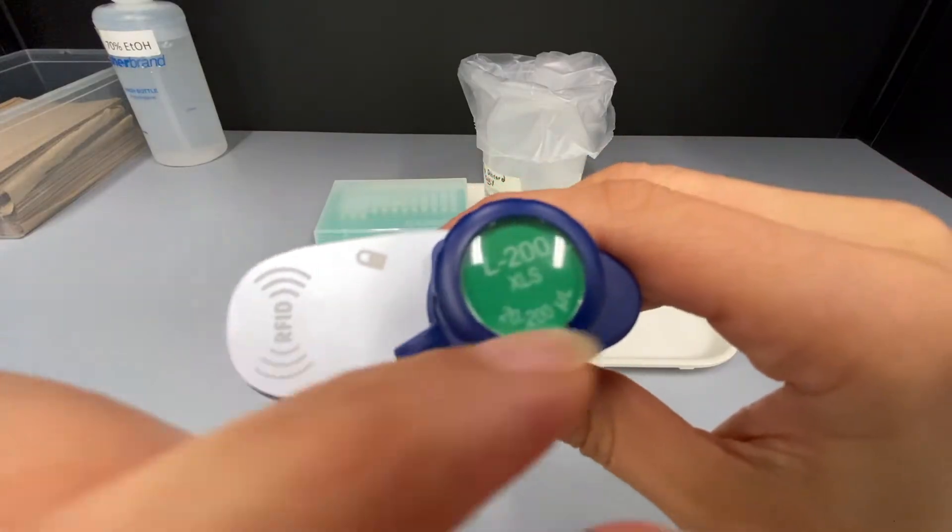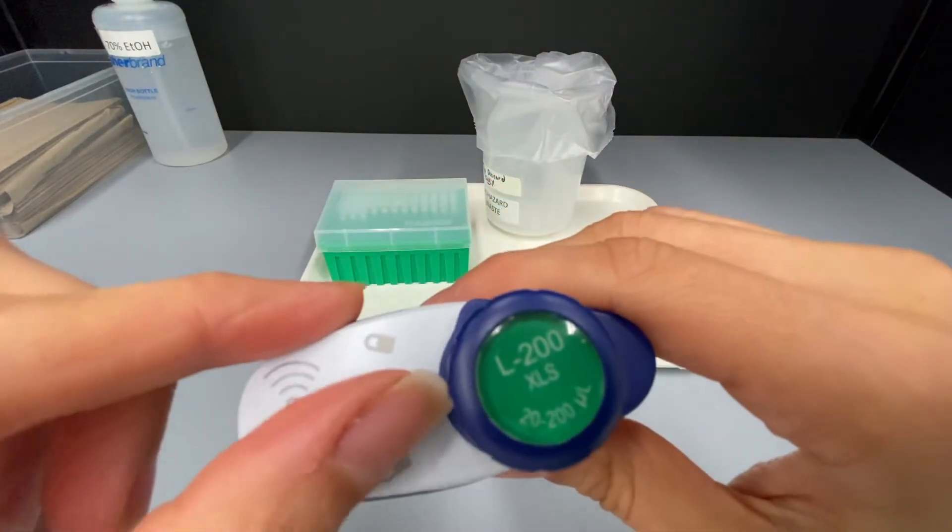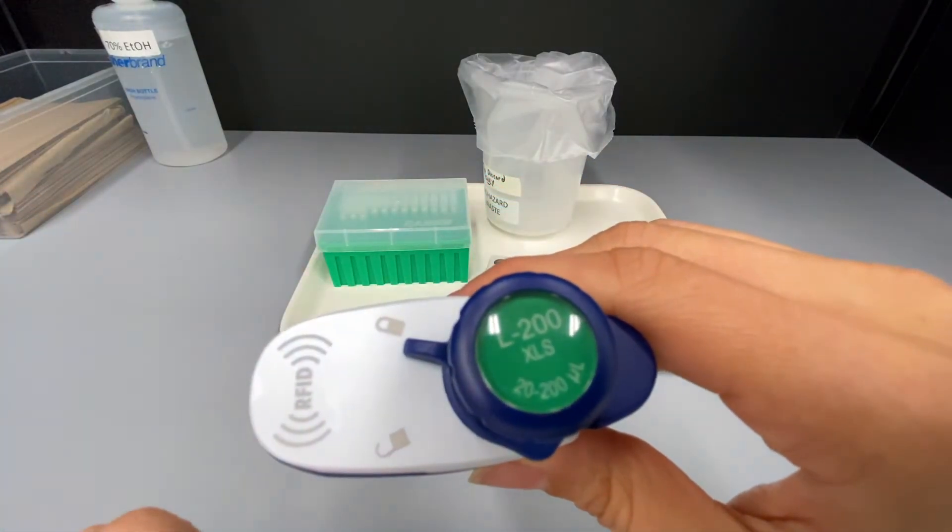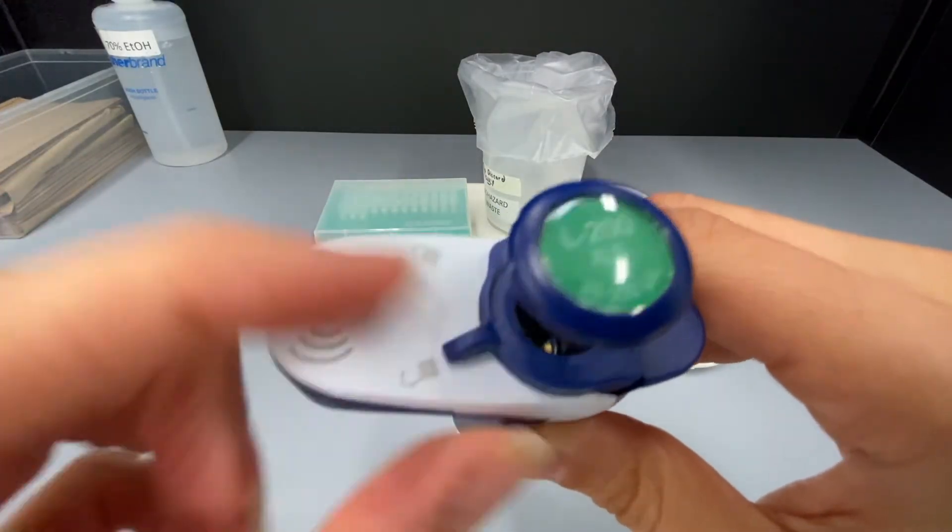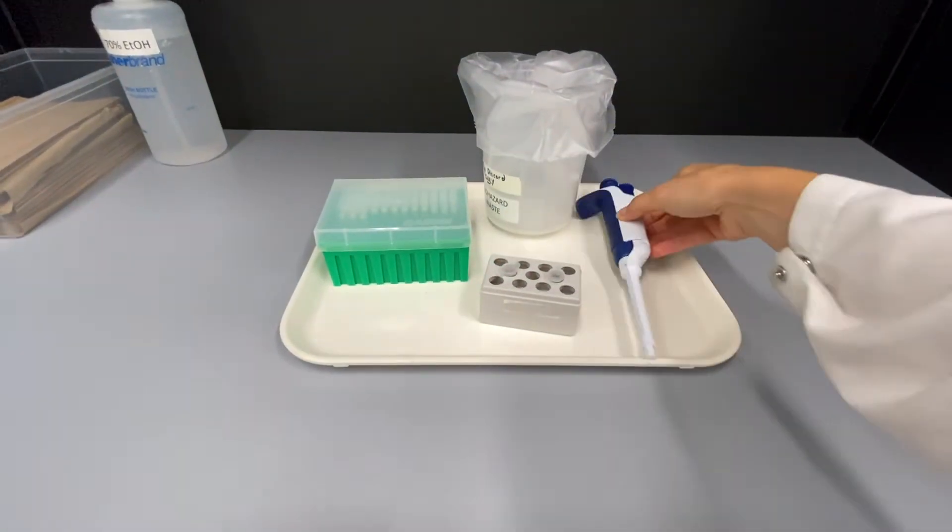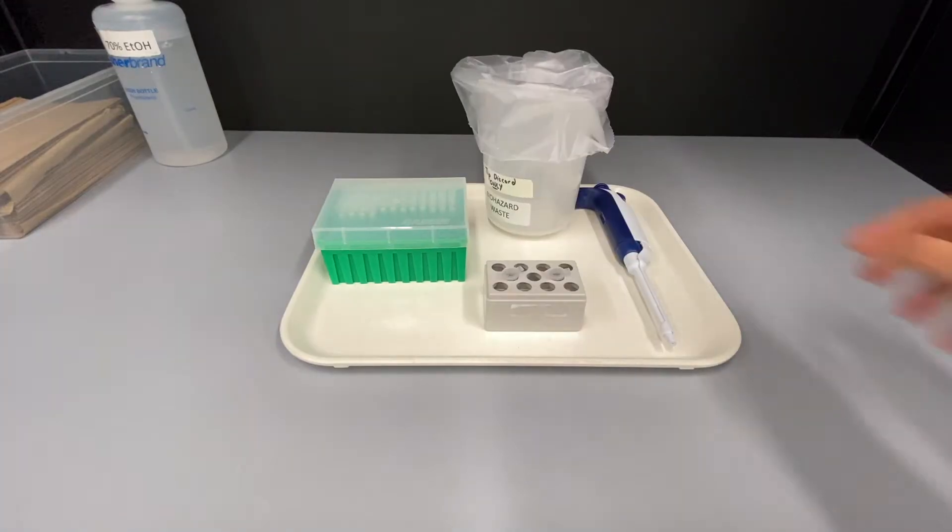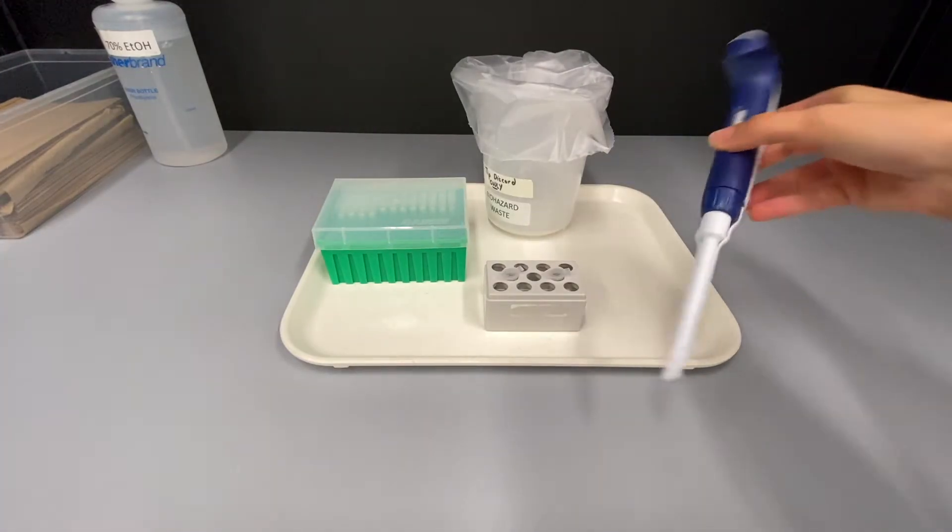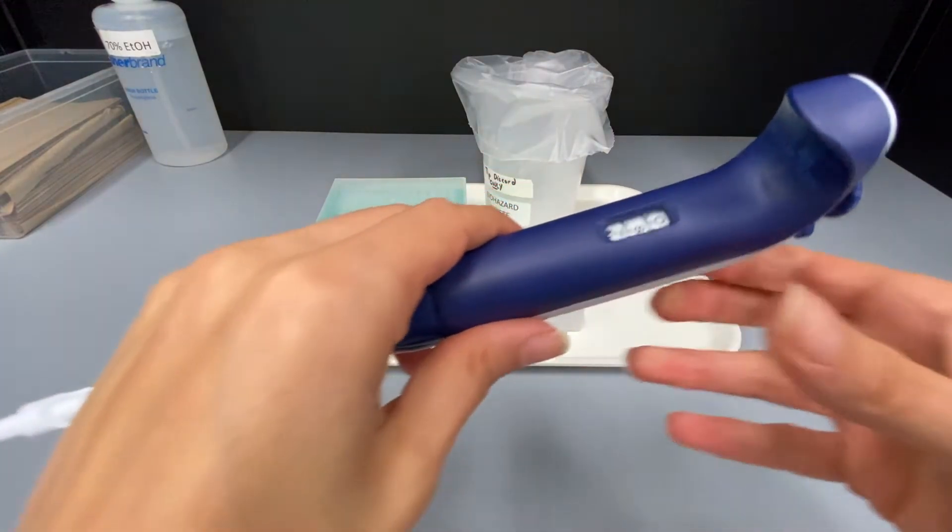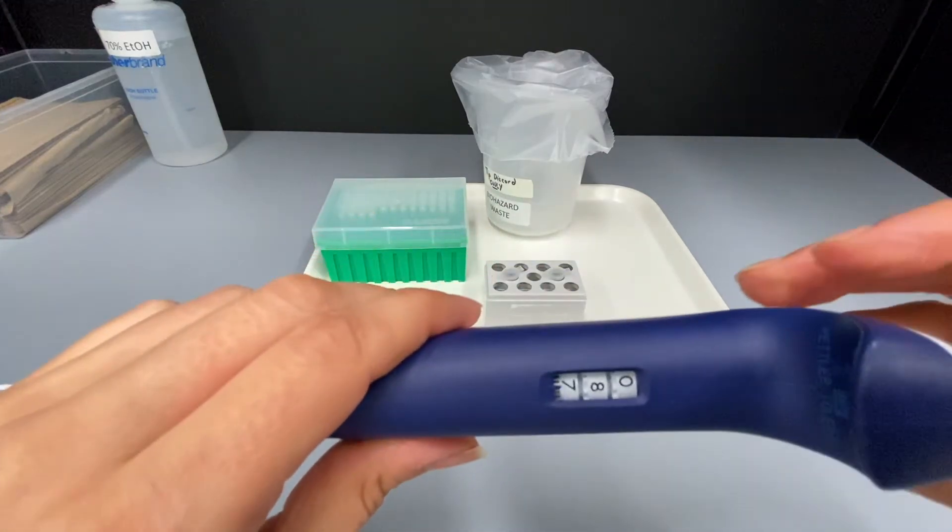Depending on the model of pipette in the lab, you may or may not have a locking mechanism like this one. If you have a locking mechanism, you must make sure it is in the unlocked position before adjusting the volume. The volume indicator tells you how much volume the pipette is currently set to pick up. Right now it is at 0, 8, 7, meaning it is set to pick up 87 microliters.